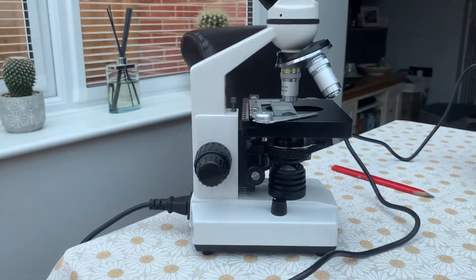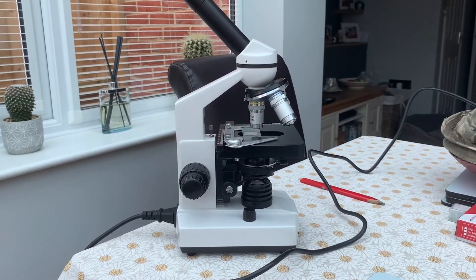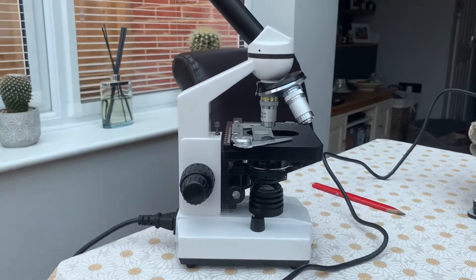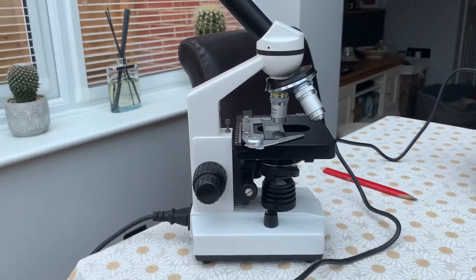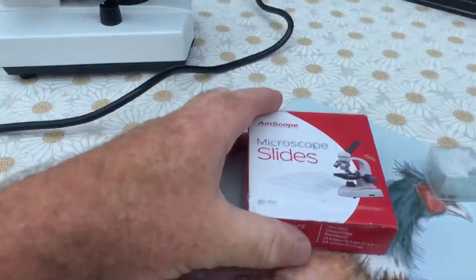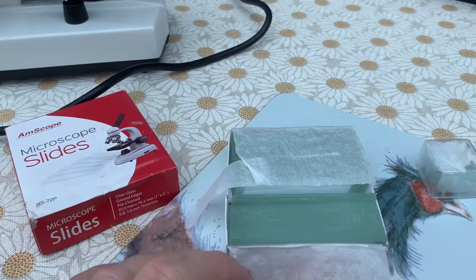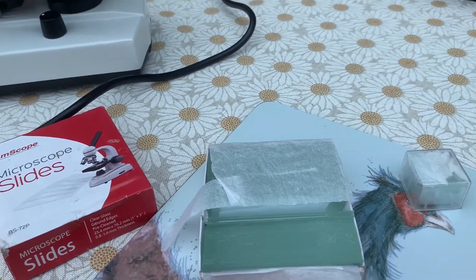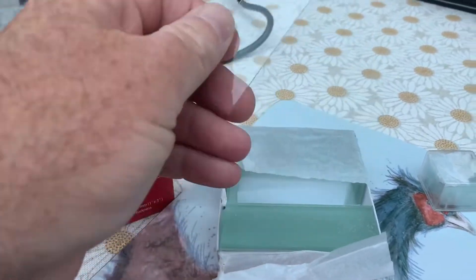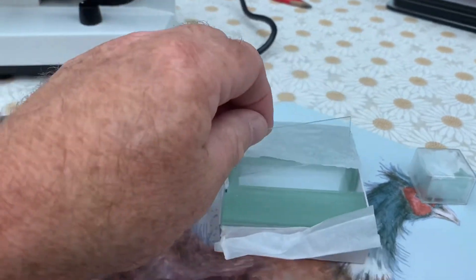When you've got the microscope there and you're pressing your eye against it — especially if you've got cats or dogs around — you don't want it to fall over. So that basically covers the microscope and what to look for. Then obviously you need your slides. These are readily available on Amazon; they come in boxes of around 100 or so. They're individually wrapped, nice clear glass slides that you put your sample on.